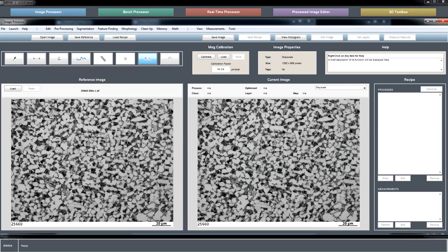So this one I'll kind of do live. I haven't really played with this image. There's no prep work here. This is winging it. This is how winging it looks. We'll see how it goes. Let's try first without cropping the image and see if we can deal with the crop.